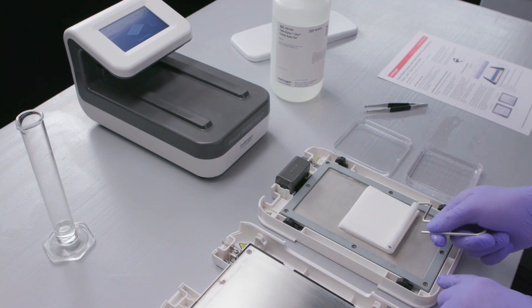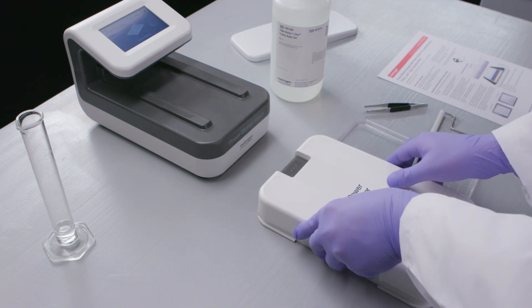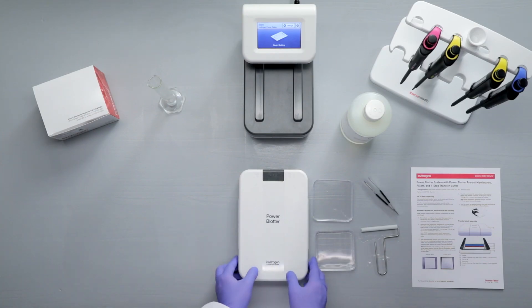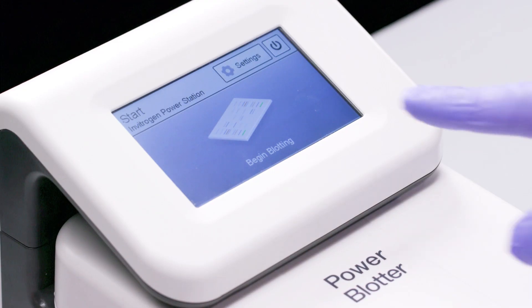If transferring more than one gel, ensure there is one centimeter of space around all stack edges. Place the cathode lid on top of the anode and gently press down on the top of the cassette to lock it into place. Slide the assembled cassette into the power blotter station.